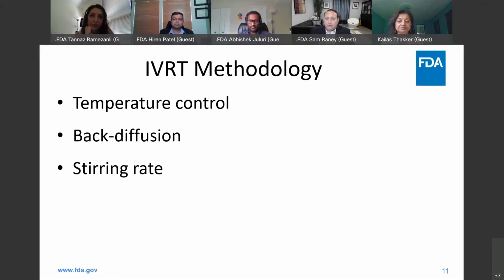What that basically means is, can you please just explain? And sometimes it's not a complicated explanation. Doesn't necessarily mean that you've got to go and spend $100,000 and do a study. If you explain, this was the stirring rate selected at 600. Our apparatus is fixed. It uses clock motors that are highly precise, but they're not variable because they're tied to the cycle of electricity. So we've qualified it.